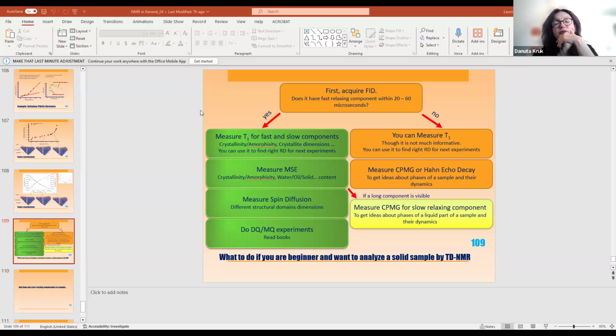But the thing is that this applies if you have a system like, I could agree with such an explanation if you look, for instance, at a hydrated protein or something like that. However, what if there is no exchange?